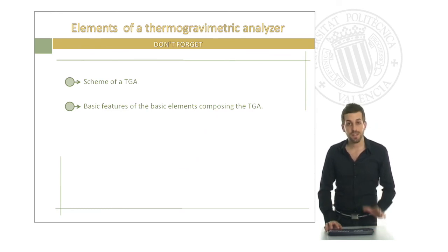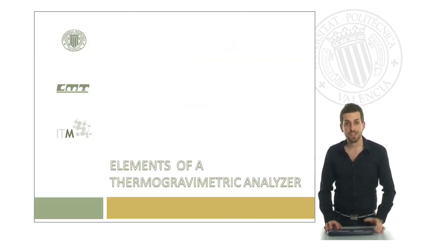Don't forget the scheme of our TGA, as well as the different elements that you can see in any TGA. Now it's your time to identify the different elements in your own TGA.